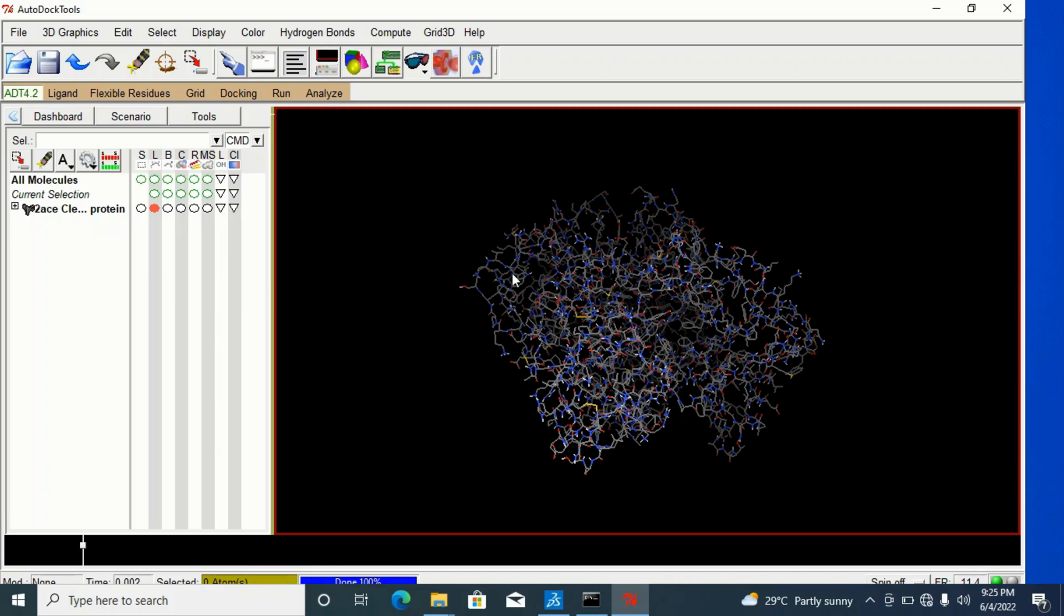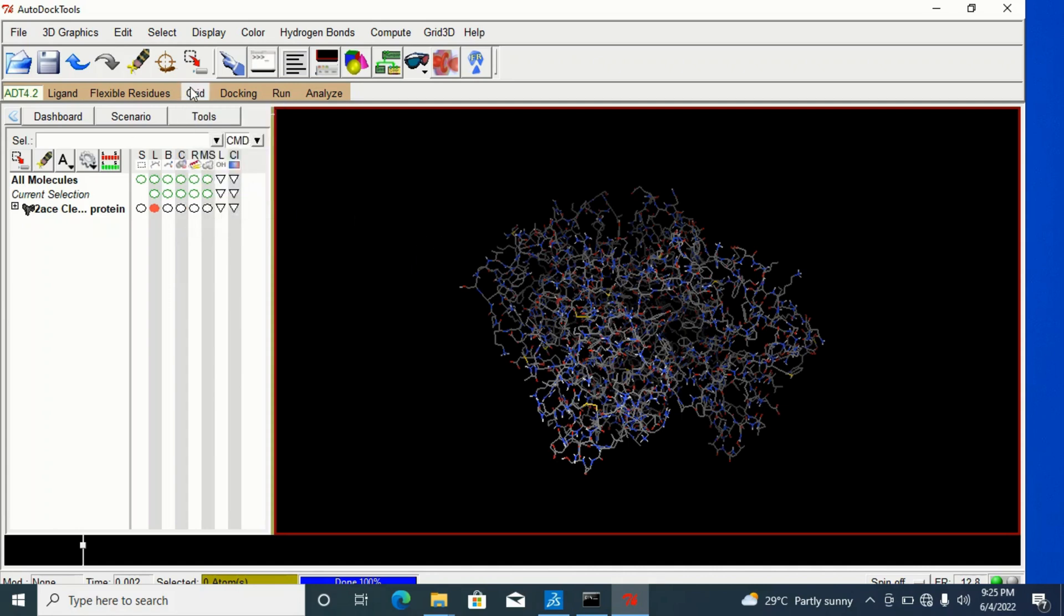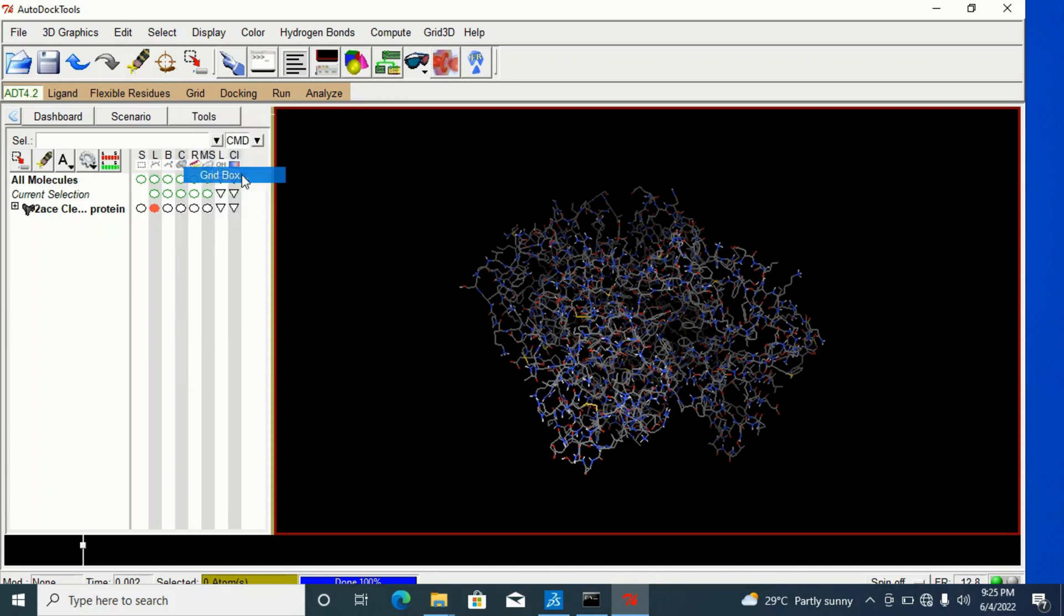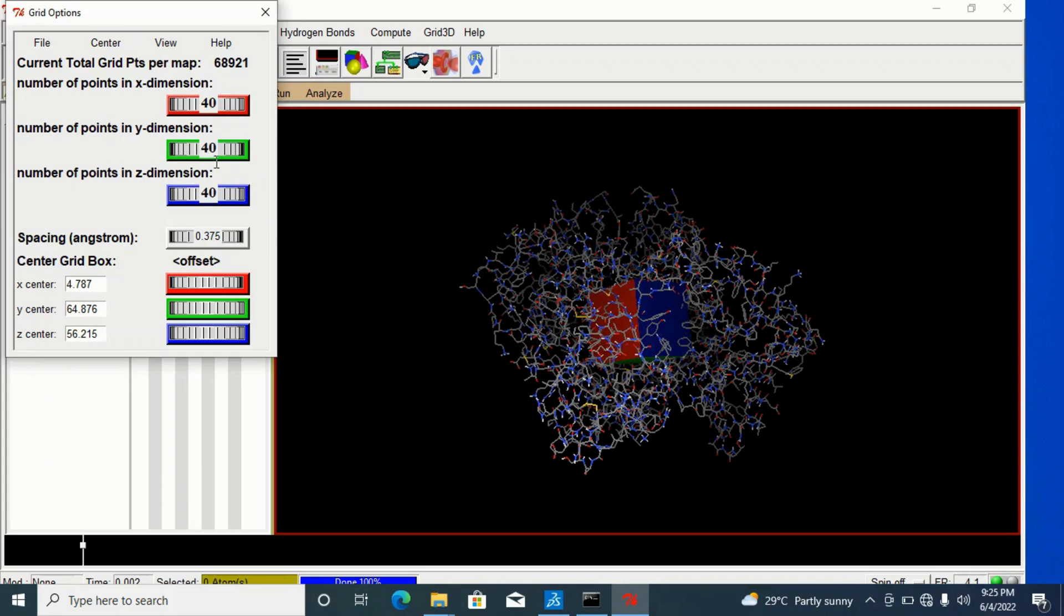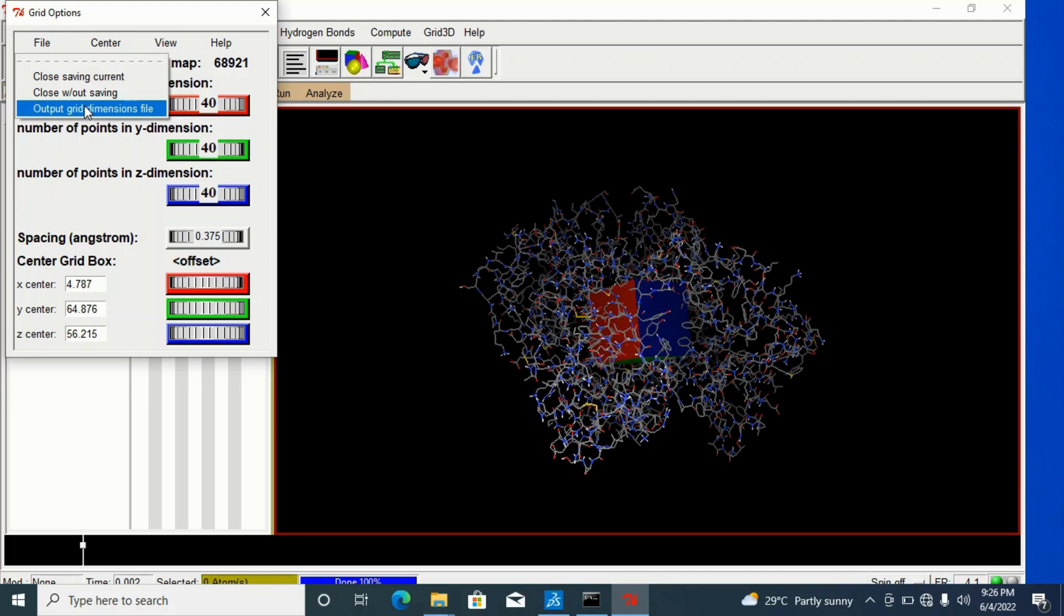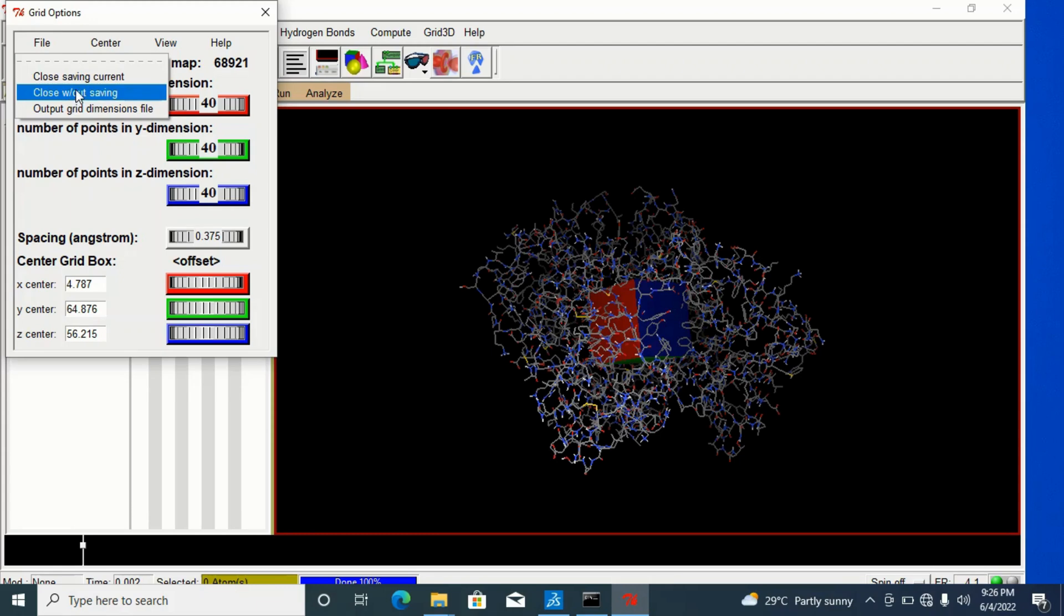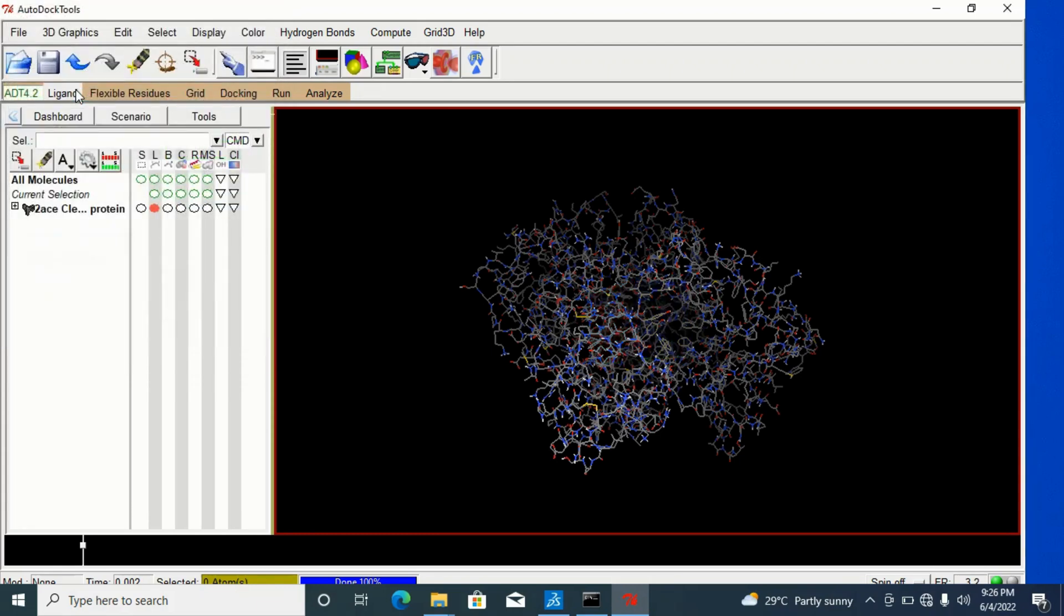Remember, while adding your grid box, after you add your grid box, when this appears, when you are done saving the file dimension, you simply close this. You close without saving. You don't need to save. Close saving current. Just close without saving this way. And it's closed. And you are done with that.